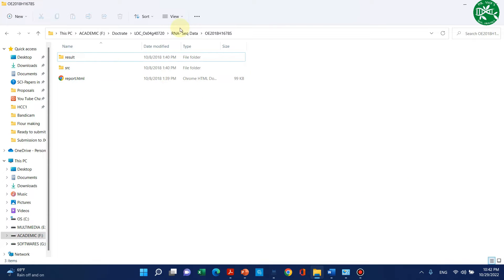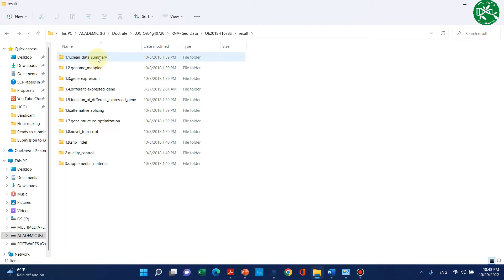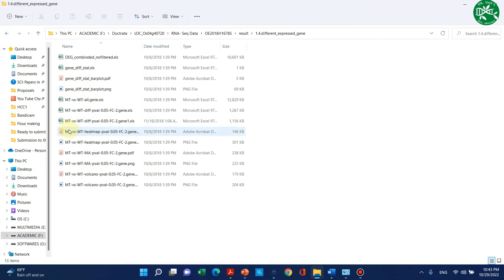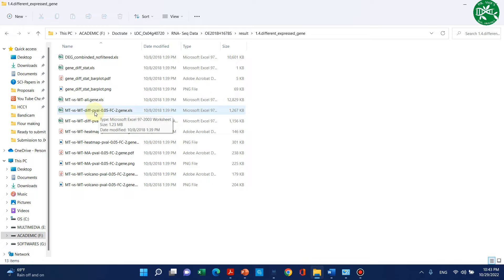Here is my RNA-seq data which was sent to me by a company. You can go to the result folder — here you can see there are different folders. Select the folder which shows the differentially expressed genes. Here you can see different lists, and here is the list we require. I have two treatments: one is the mutant type and the second is the wild type. It shows the differentially expressed genes at p-value less than 0.05 and FC value greater than 2.